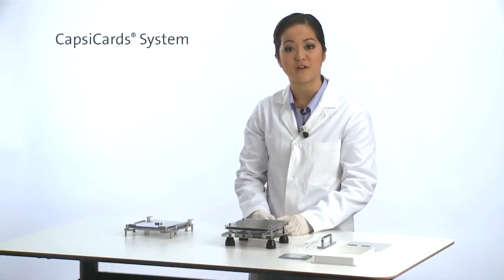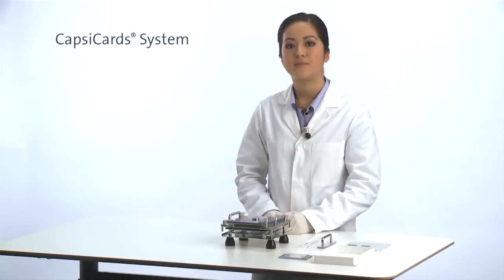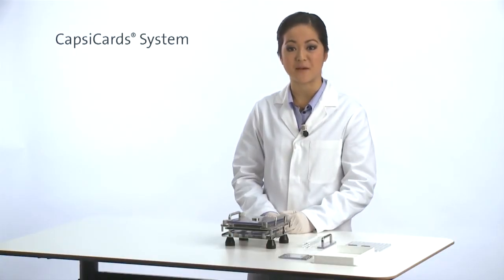Then place the caps tray on top of body sheet C. You now have a fully assembled CapsiCards machine.